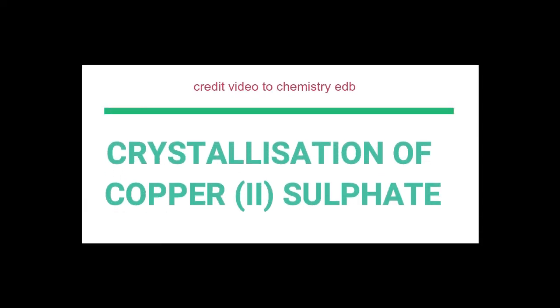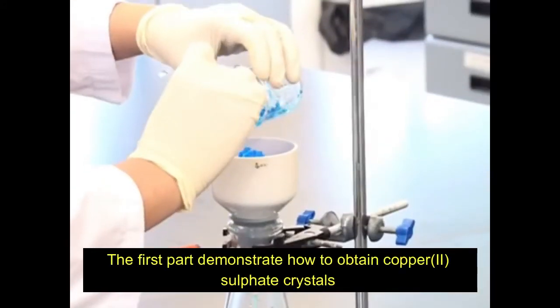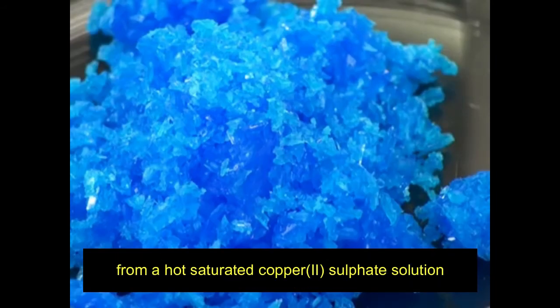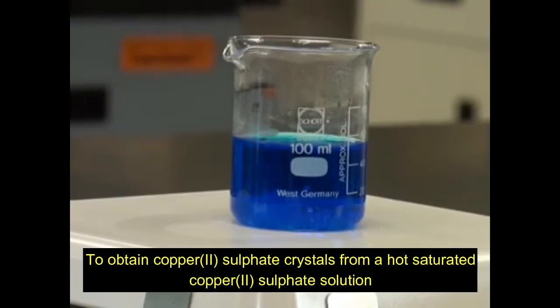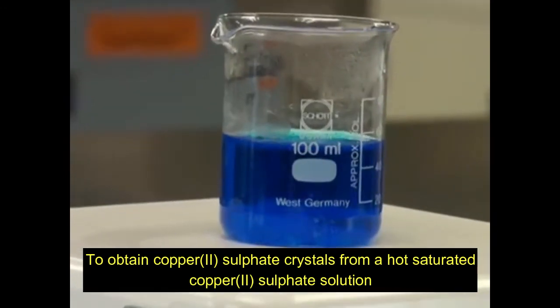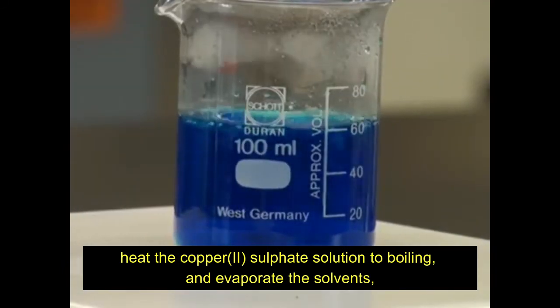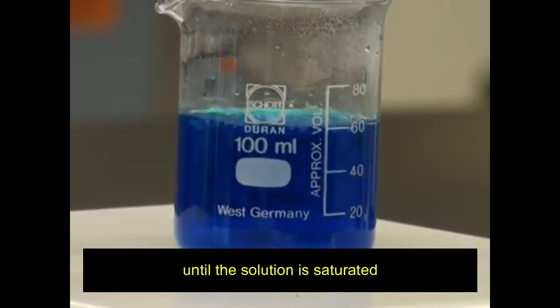Second, we are going to learn the crystallization of copper 2 sulfate experiment. The first part demonstrates how to obtain copper 2 sulfate crystals from a hot saturated copper 2 sulfate solution. Heat the copper 2 sulfate solution to boiling and evaporate the solvent until the solution is saturated.